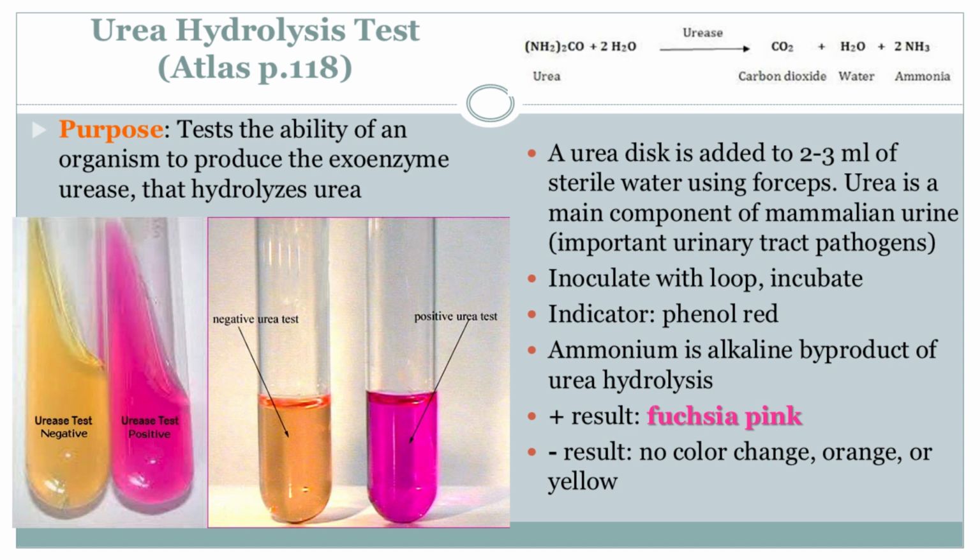And to make things even easier, there's usually a chart in the lab that summarizes the key points of the urea hydrolysis test. Oh, so it's like a cheat sheet for bacterial behavior. You could say that. It helps make sure everyone interpreting the results is on the same page. It's amazing to me how much we can learn from something as simple as a color-changing broth. It's like these bacteria are sending us secret messages. It really highlights how even the smallest details can reveal a lot about the world around us.